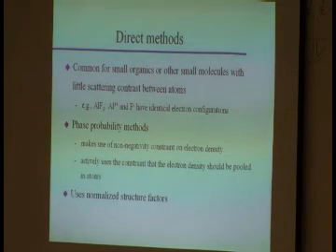So far we've said we locate our heavy atoms with Patterson methods. But what if we don't have heavy atoms? Well, the second method that is implemented in pretty much all small molecule crystallography programs is called direct methods. So if you have a purely organic molecule, you usually use that one. Or if you have something that just doesn't have a lot of scattering contrast between elements. Prime example would be AlF3.